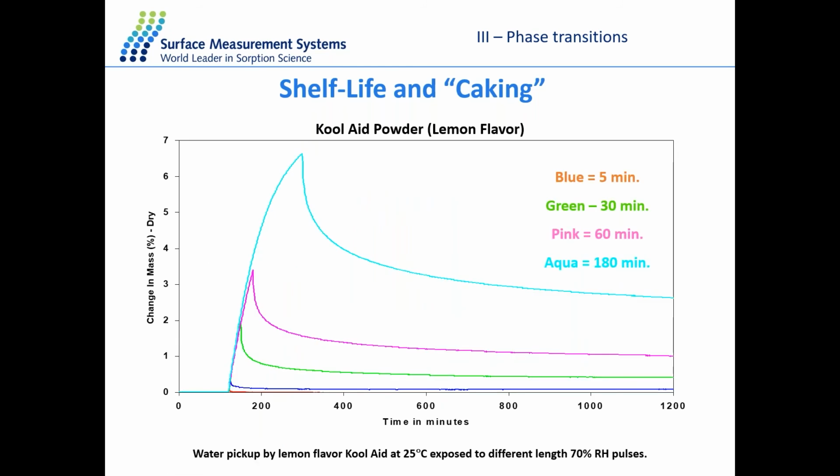This experiment can be done using different amounts of time. By increasing the time from 5 to 30 to 60 minutes of exposure to the burst relative humidity, we will have different resulting amounts of water becoming part of the sample itself. But it's also important to look at the cycling of the sample between high and low, high and low.